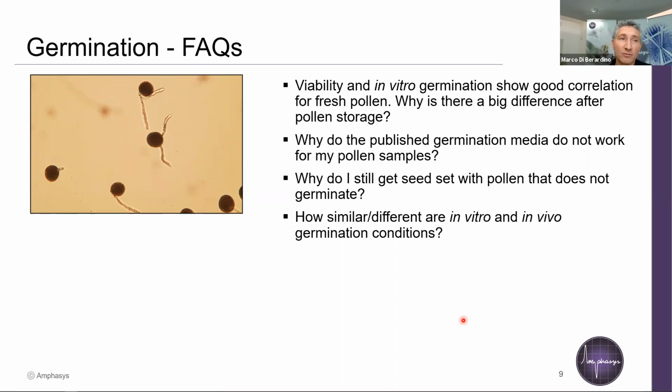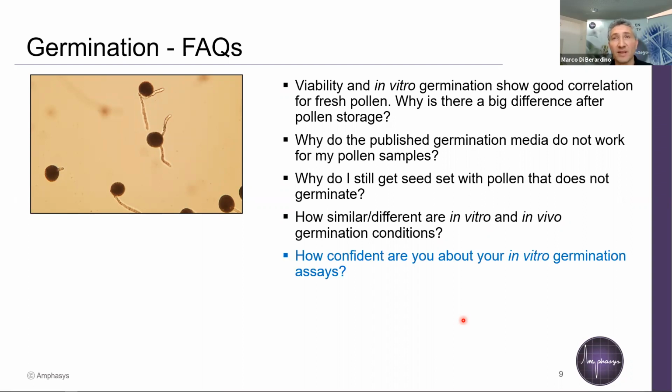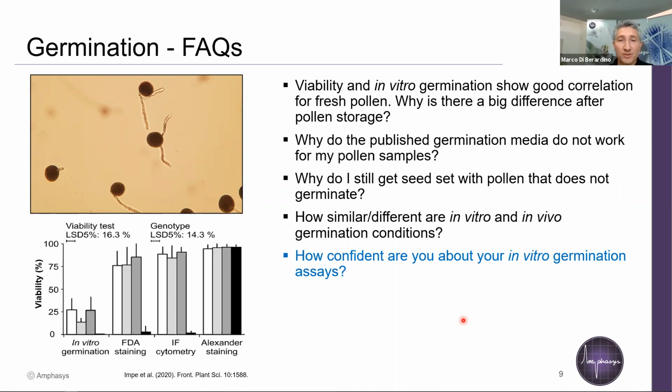Another question that I would actually ask you directly is, how confident are you about your in vitro germination assay? In a recent study published by the group of Manuela Nagler from the IPK in Germany, they basically compared different in vitro pollen analyses on wheat pollen, on different lines of wheat pollen.